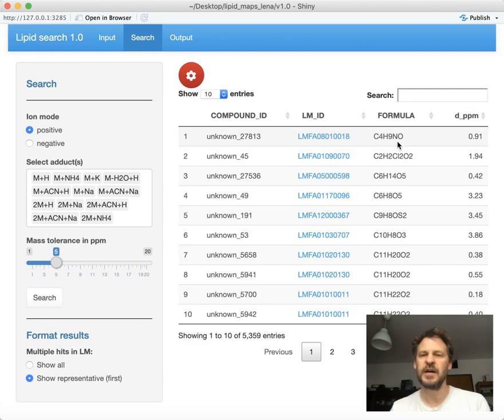They're isomers, and it may or may not make sense to look at all of these isomers here in this table. If you want to see all of them, then your table is going to grow. But here, what we're doing, we're looking only at the first one, which I call the representative. It's essentially the first one that comes up that has this formula.